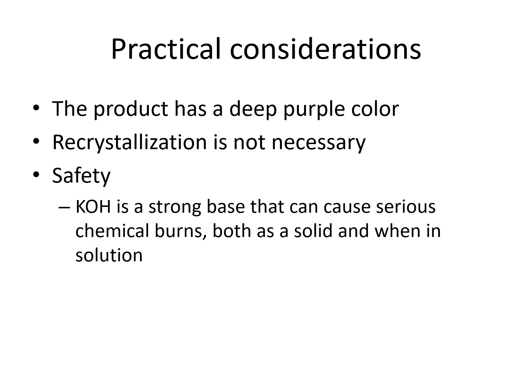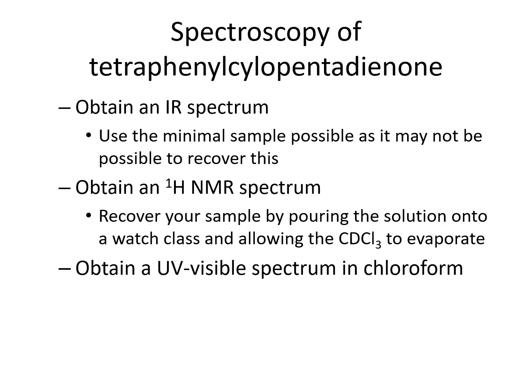And yeah, the safety matter for the experiment is that we have used potassium hydroxide, which is one of the strong bases, and because most of the strong bases are corrosive to our tissues, we need to be careful in this case, particularly by wearing gloves.